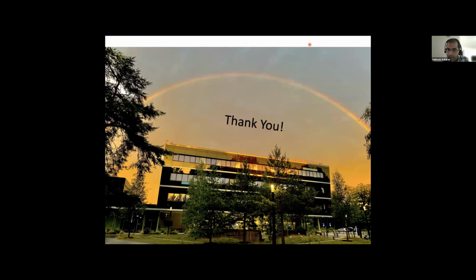Okay, question from Ming Seng. Very nice talk. Compared with wide field iSCAT, in addition to getting rid of the speckle artifacts, does confocal iSCAT improve the sensitivity as well?